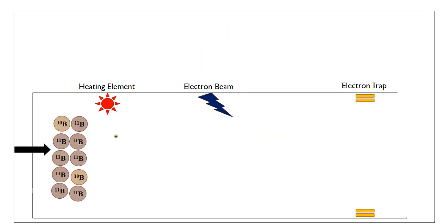Let's say this is your input. So you start with a sample of boron. Remember that the whole point of this technique in this particular context is to determine how many isotopes an element has, the relative isotopic mass, as well as the percentage abundance of each isotope. So let's say we have 10 atoms of boron coming in.